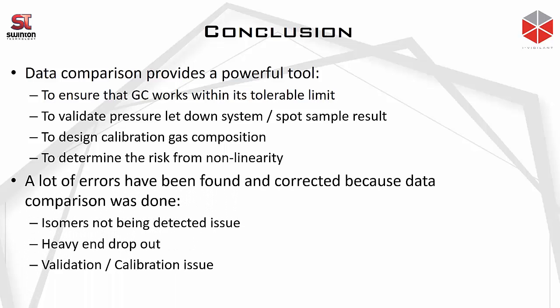A lot of errors have been found and corrected because the data comparison was done. Some of the examples are that we've identified some isomers not being detected, and we identified an issue with the heavy end dropout. We also identified a validation or calibration issue, and a few other issues that have been detected that are not covered here.